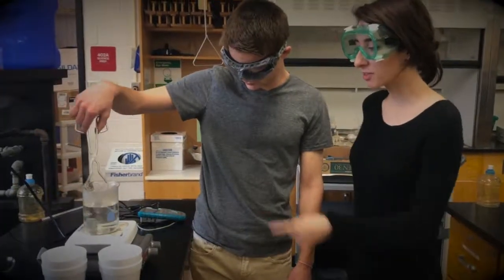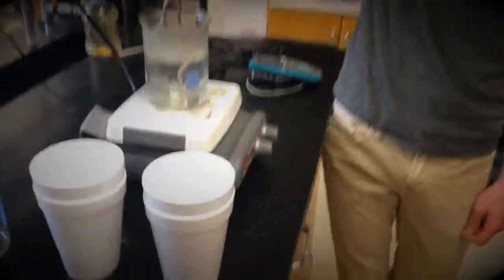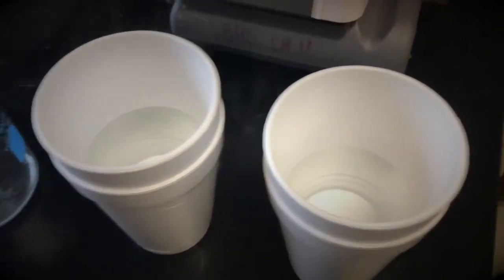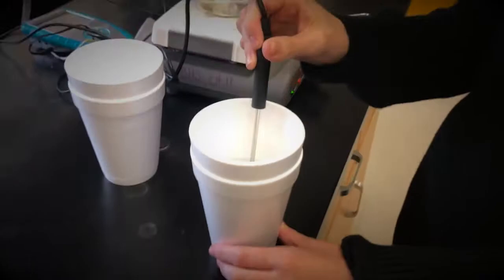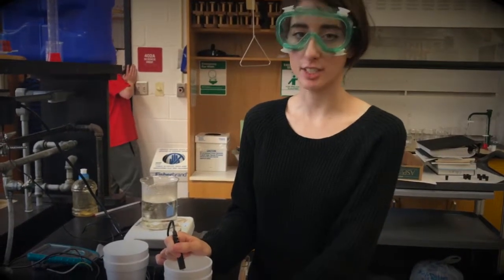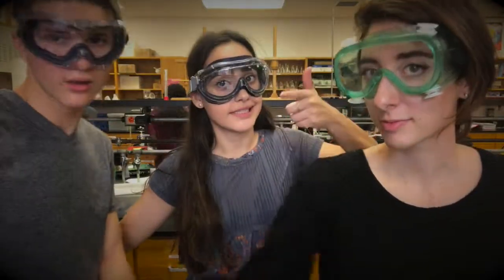Carefully but quickly remove the metals from the beaker and place them in 2 separate foam cups. Measure the highest temperature reached in each foam cup. This is considered to be the final temperature of the system. Repeat steps 2 through 8 for a second trial. After completing the second trial, take the average of all your data.